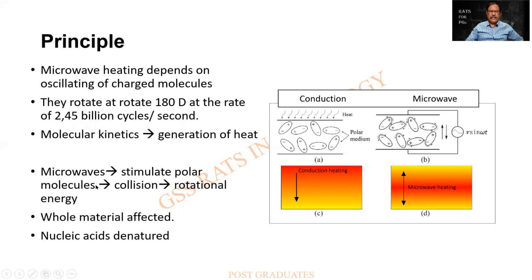Microwaves, stimulation of the polar molecules, collision, rotational energy, etc. And finally you find that the whole material gets uniformly affected in microwave processing. The nucleic acids, of course, are denatured, paving the way for subsequent processing.